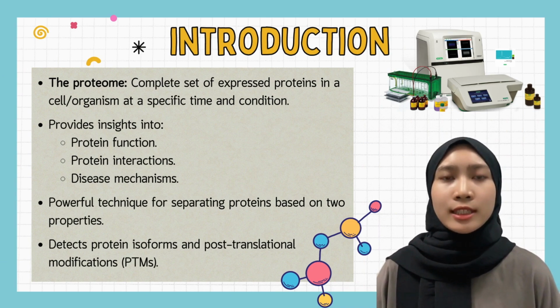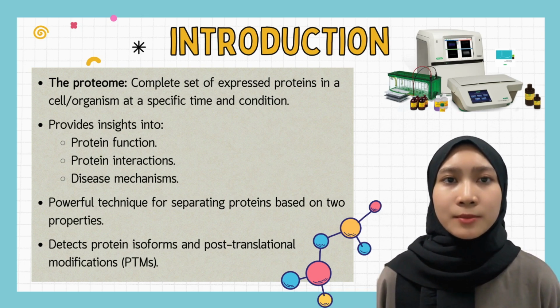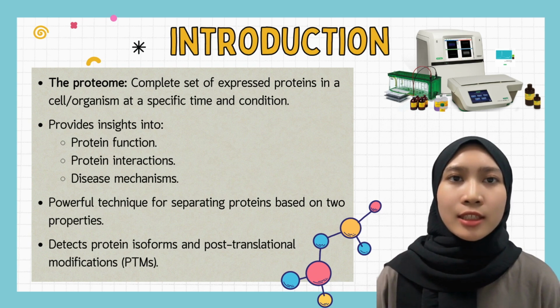Today we're going to present about 2D SDS-PAGE. What is 2D SDS-PAGE? 2D SDS-PAGE is a technique used to separate proteins from a complex mixture based on two properties: first, isoelectric point, and second, molecular weight.